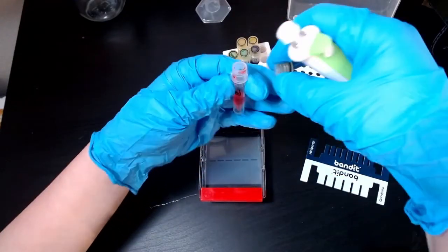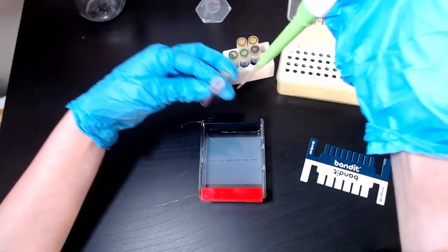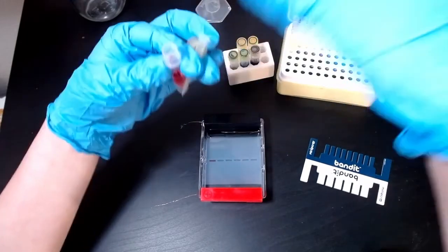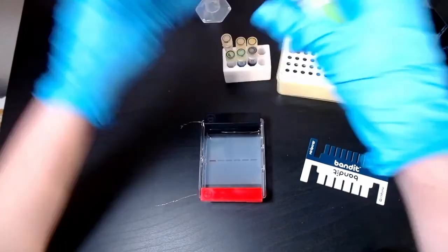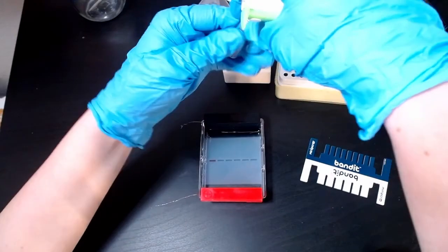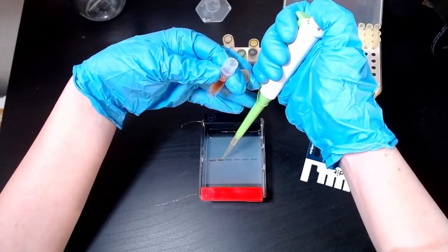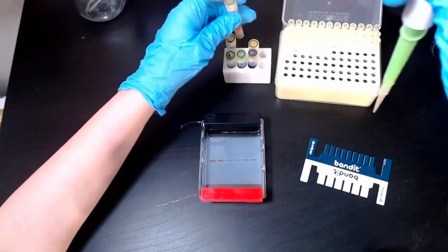So we're going to start off with 10 microliters of our red dye. This is going to go into our first well. Then we're just going to go right in color order. We're going to add our orange dye next. And this is one of our little standard size pipettes from Mini PCR. This pipette is a fixed volume of 10 microliters. So that is 10 microliters of our orange dye that I've just added in there.